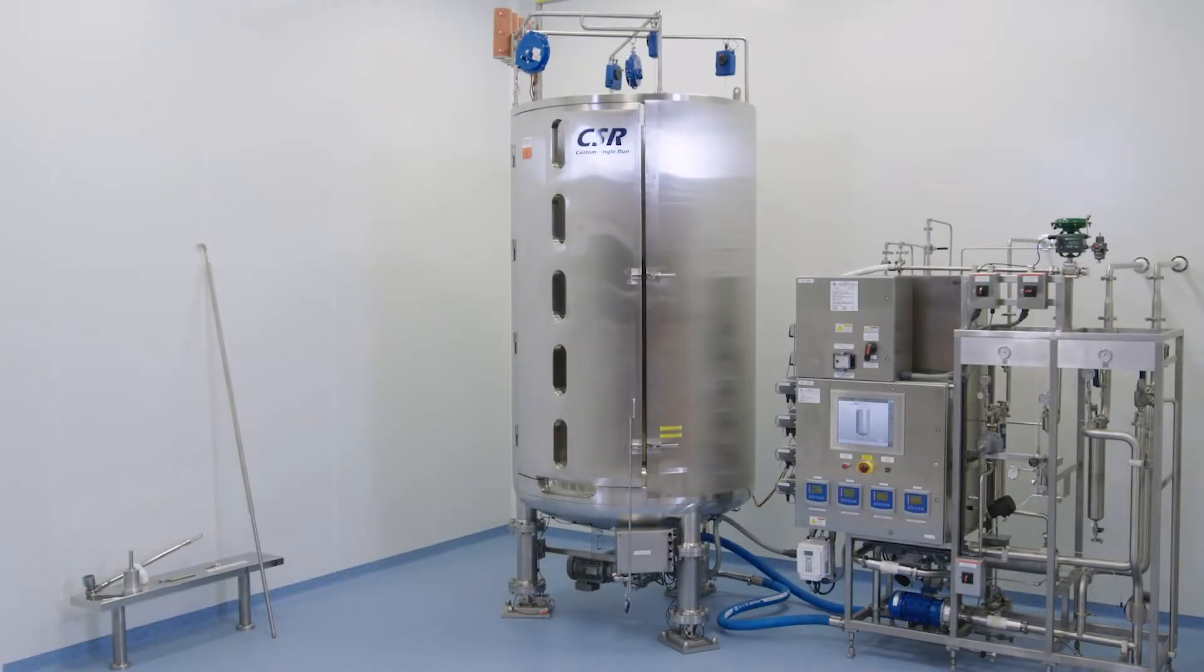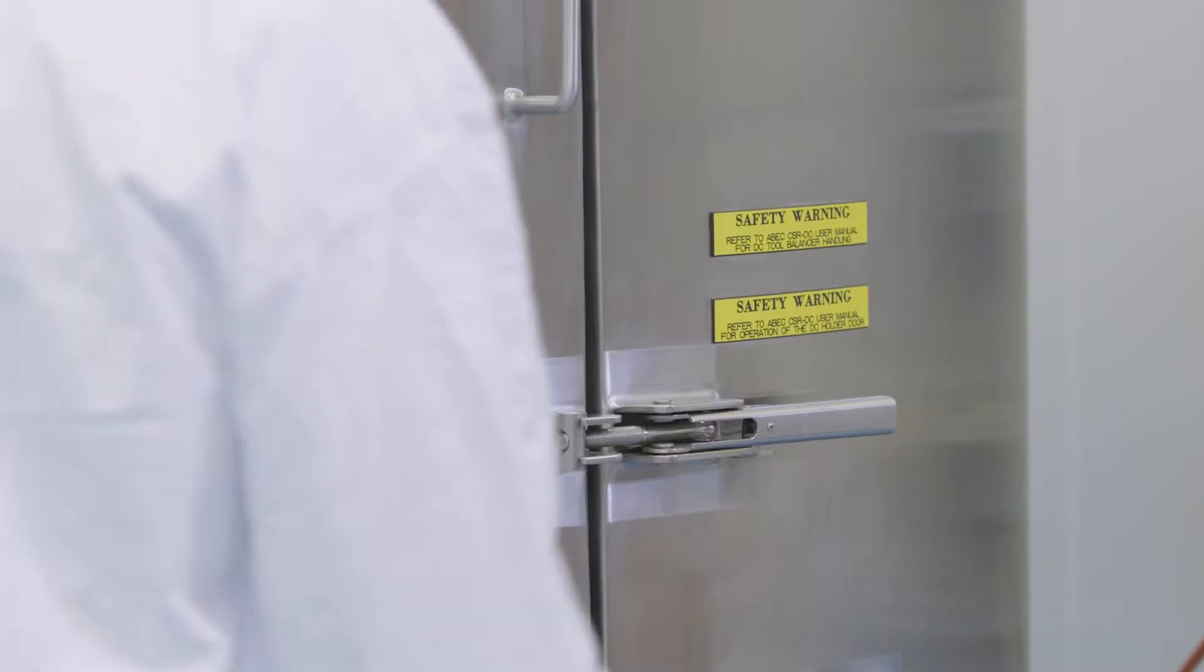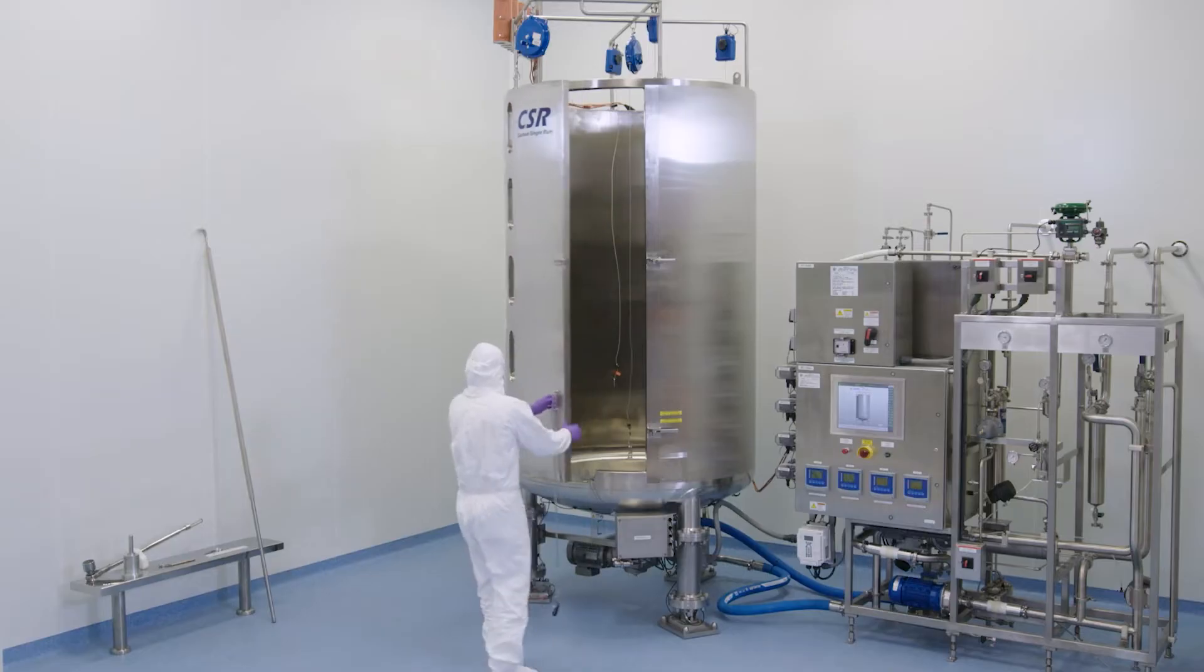The CSR single-use disposable container packaging is innovative, safe, and ergonomic, specifically designed to minimize risk of handling and impact to the film.